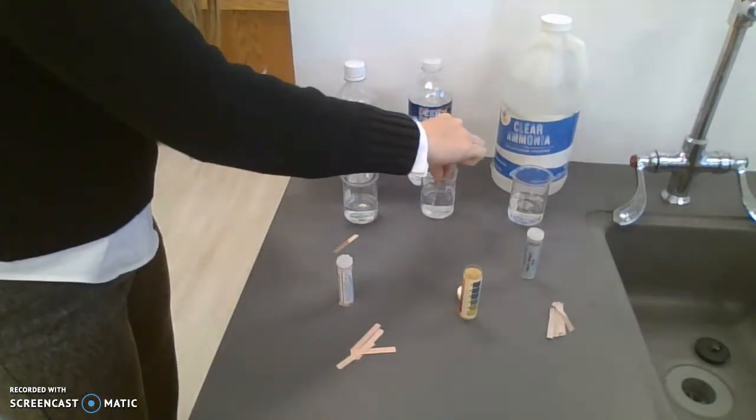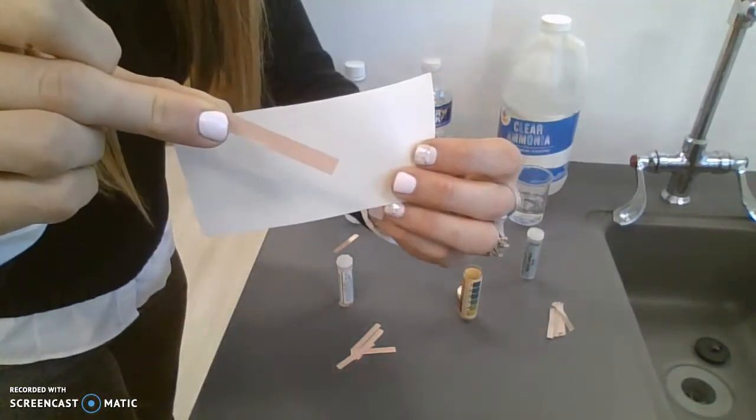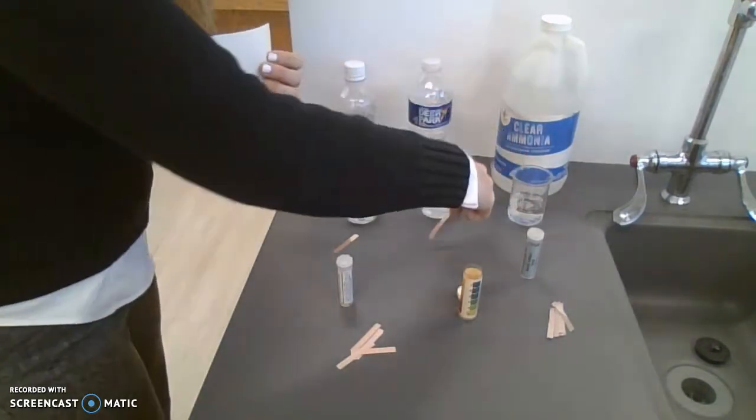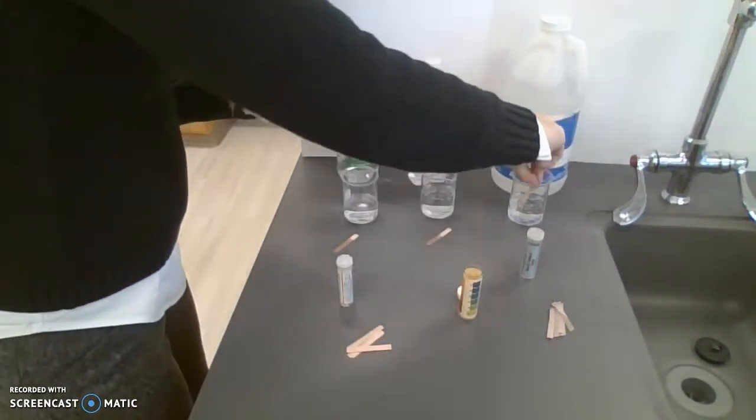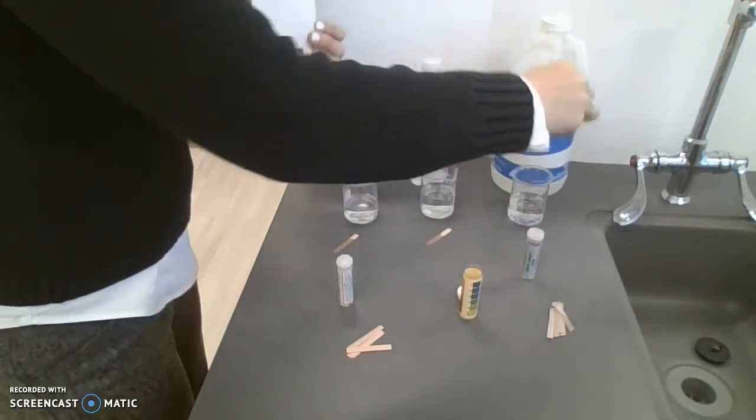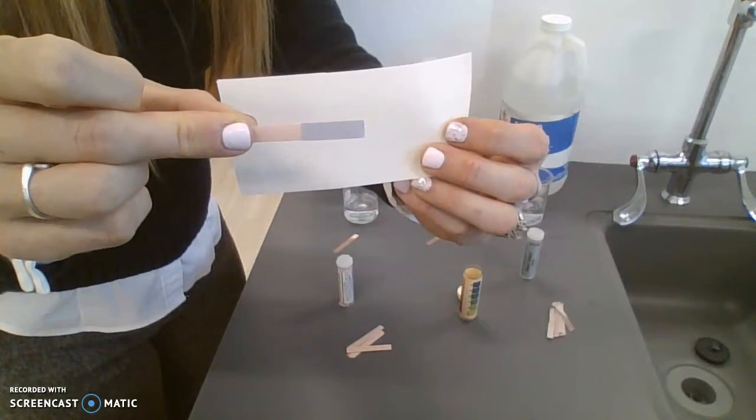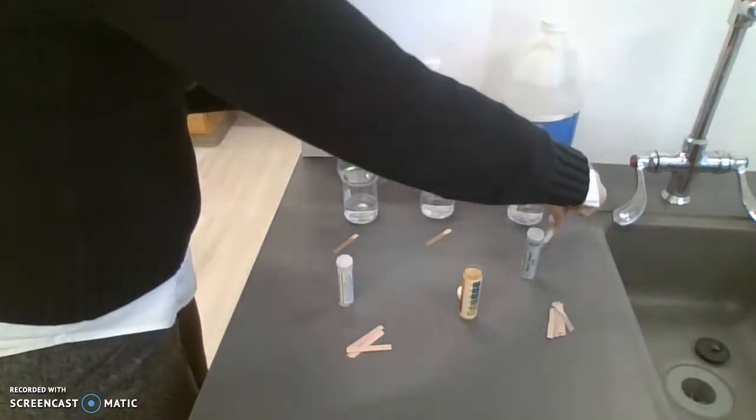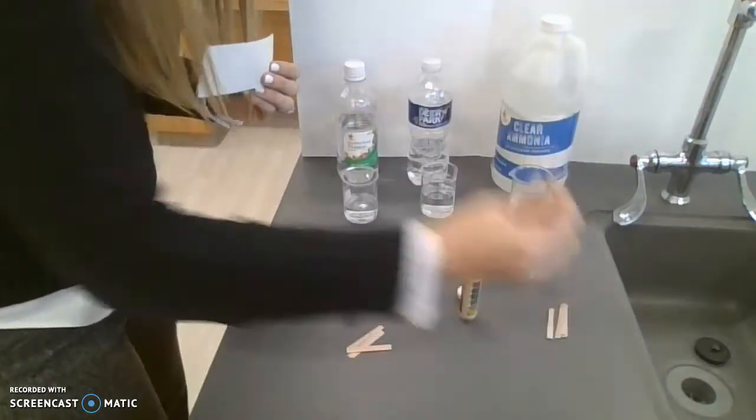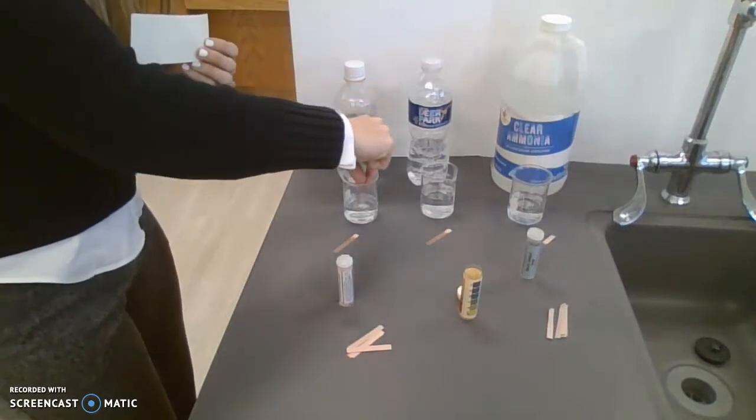So if I dip red litmus paper in water, it just appears to be wet. And red litmus paper in a base will turn blue. Bases turn blue.